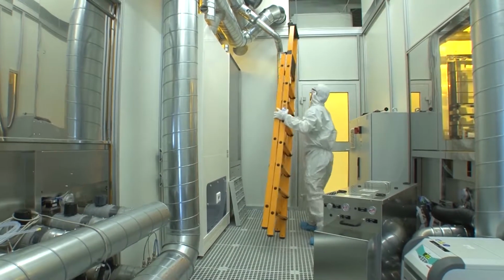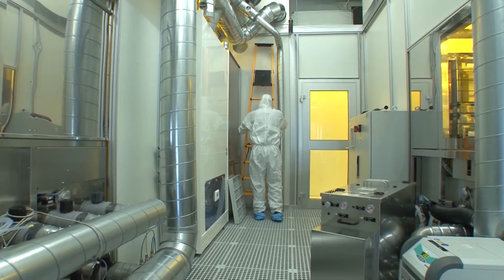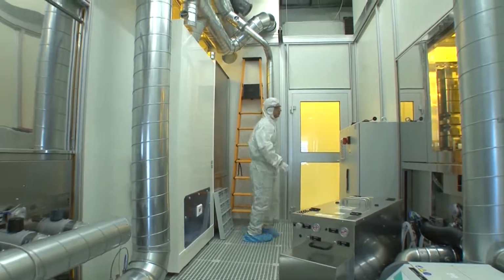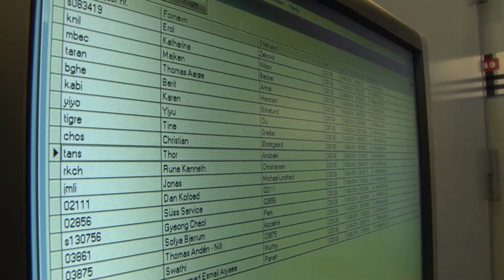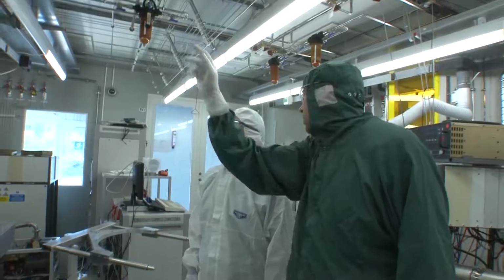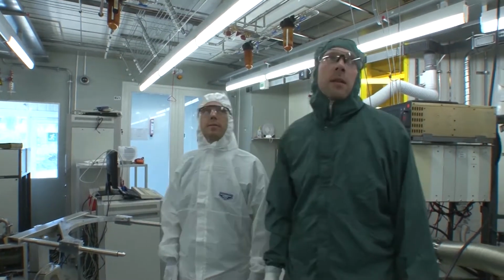In particular, escape routes, meaning particularly corridors, must be kept free of materials and articles. When the workday is over, remember to check that you're logged out of the system. Remember to always ask DTU staff about anything you're in doubt about.